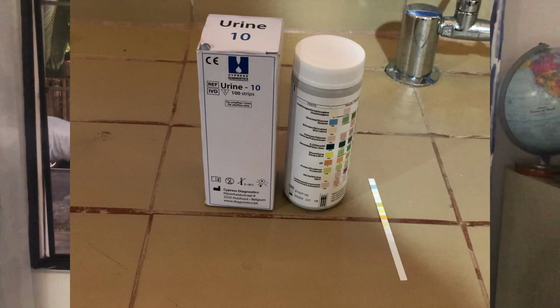Now, the materials of these projects are neither too expensive nor too difficult to find, with the only exception being the $15 urinalysis test strips, although they can be found in places that sell medical equipment. Nonetheless, if you're interested in replicating this project, we recommend you to dilute viscous substances like honey in water before testing them with the test strips, and overall, we recommend you to avoid the consumption of sodas and high sugar sauces for a better diet overall.